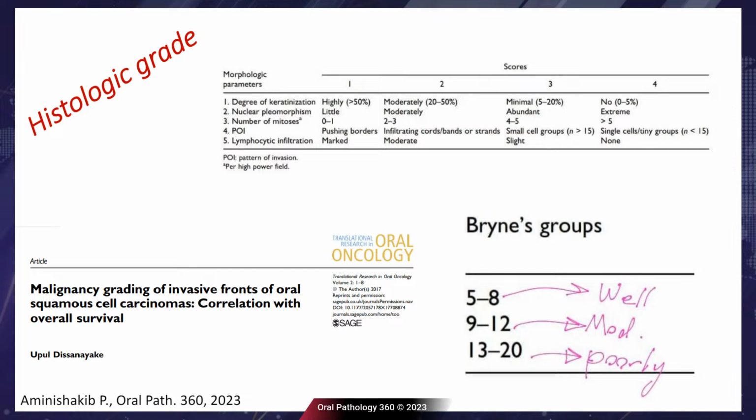And you can grade your squamous cell carcinoma as well differentiated, moderately differentiated, or poorly differentiated.